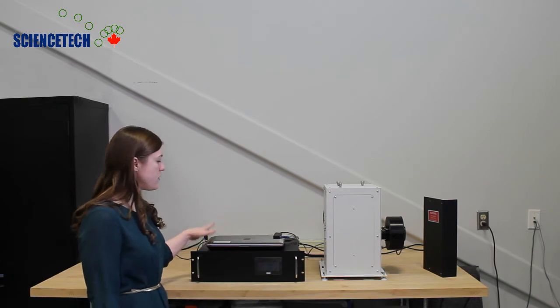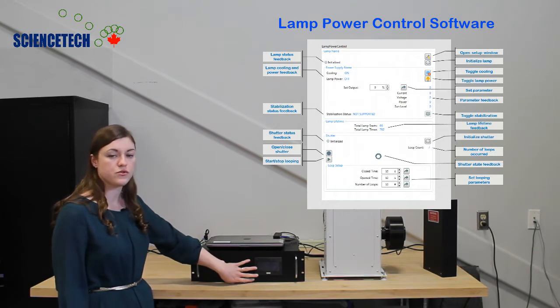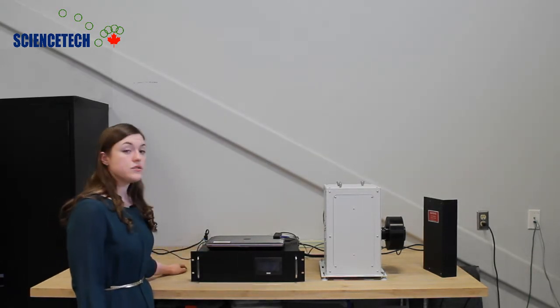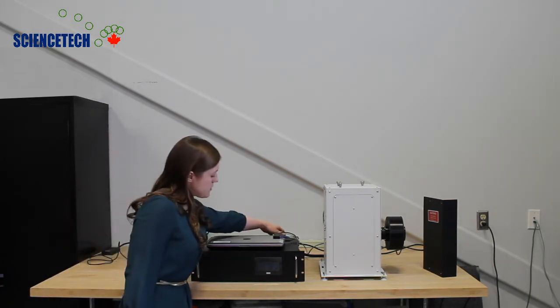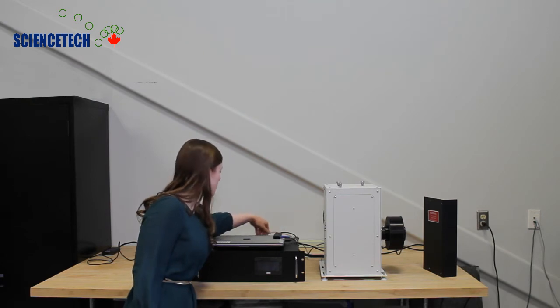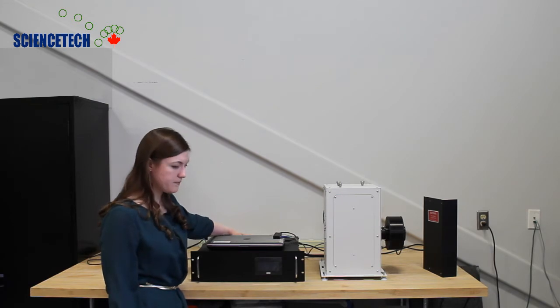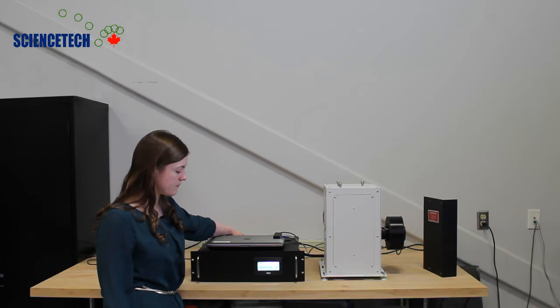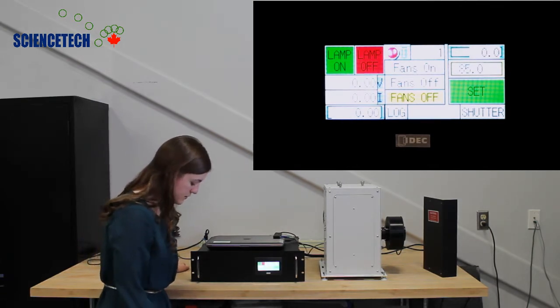To operate the system you can operate it from our software entirely or you can control it directly from the touchscreen power supply. To use the XLH series lamp housings you need to first turn on the power supply. You can see it's initialized there. Just hit OK and it brings you to the main screen.